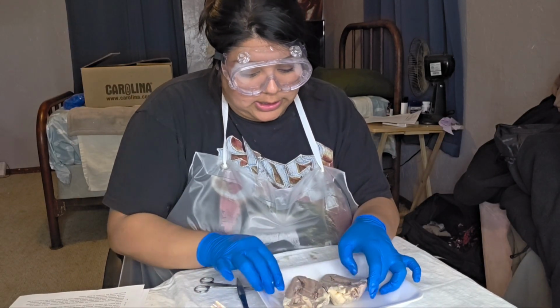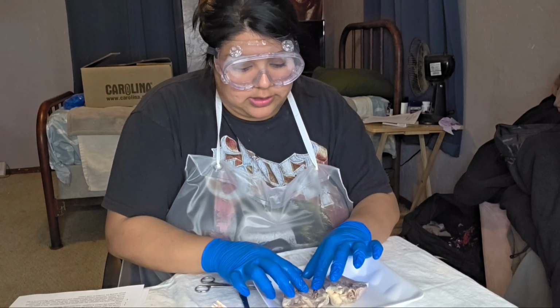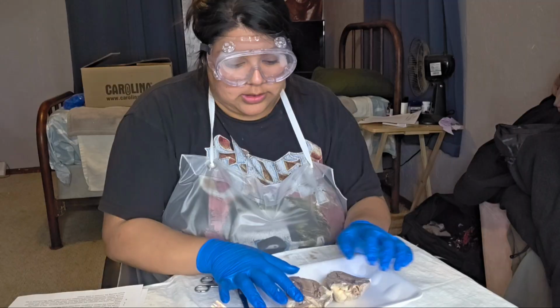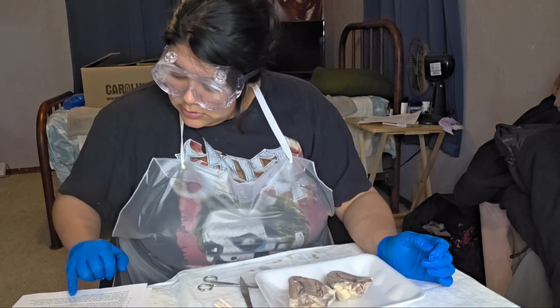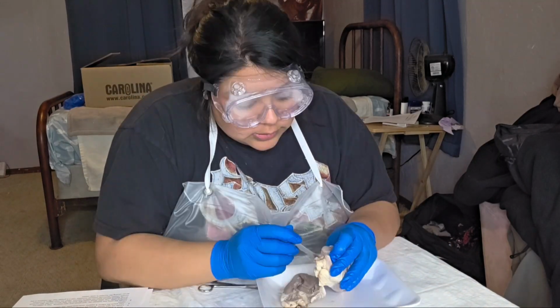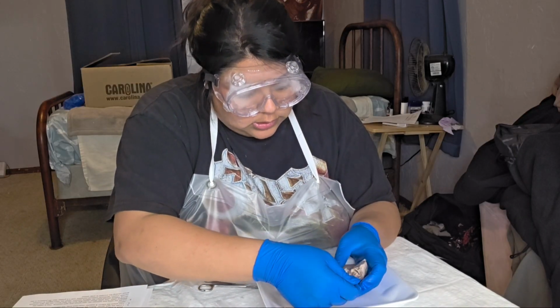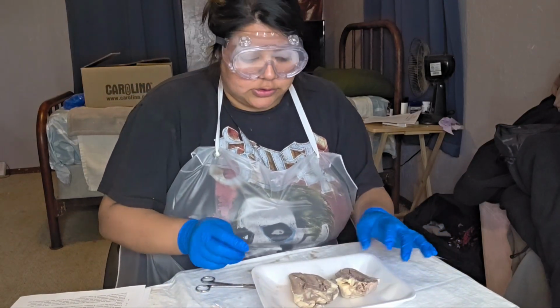So now we know this is the right atrium because the wall is so much thinner. This is the septum. So this is the right atrium, and this is the left atrium. Find where the inferior and superior vena cava enter this chamber. See, that's the aorta. Where's the superior cava? Okay, right here. Locate the valve between the right atrium and the right ventricle.